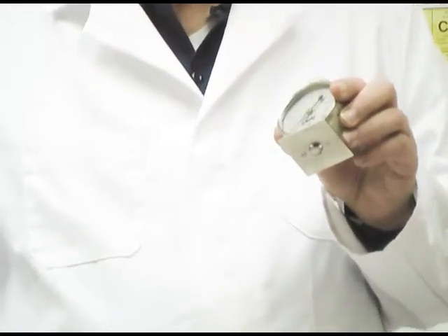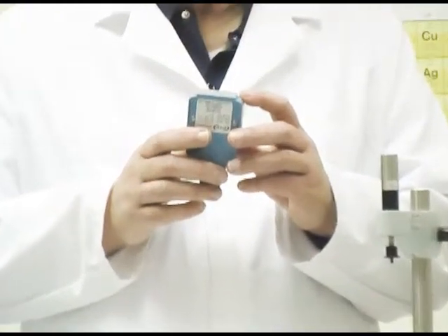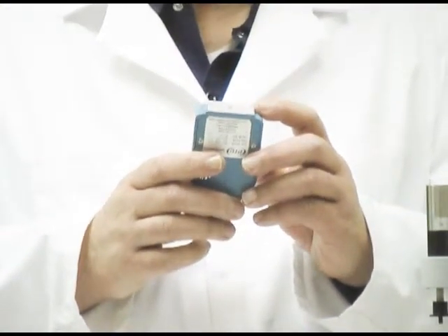You'll get a hardness reading somewhere between 0 and 100, and it's important when running a durometer test to use the right kind of durometer. Starting with the Shore D durometer, which measures the hardest plastic surfaces — the scale goes from 0 to 100. The base plate has an indenter tip extending from it, and we'll see in a later slide what the shape of this tip is.